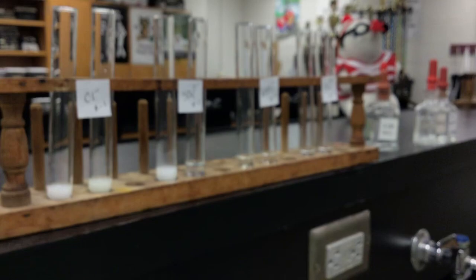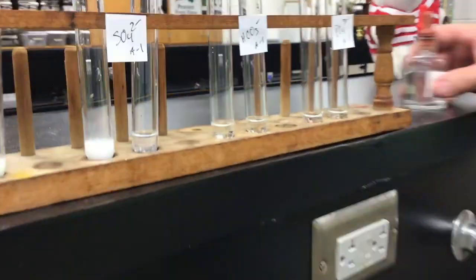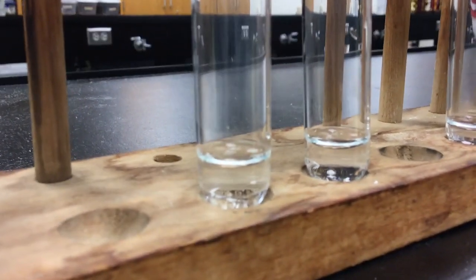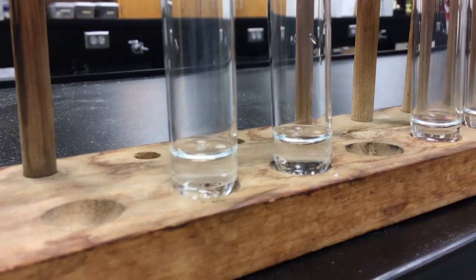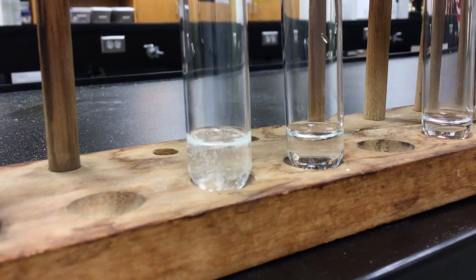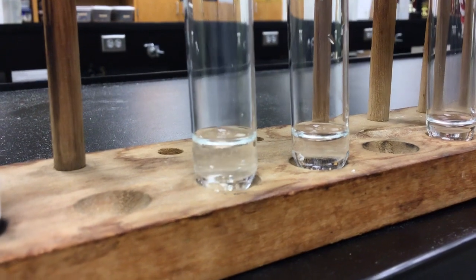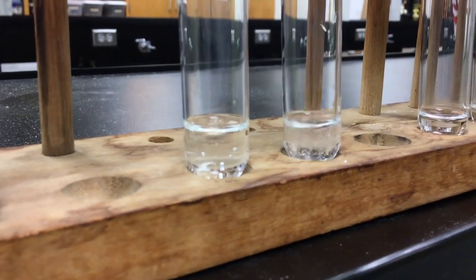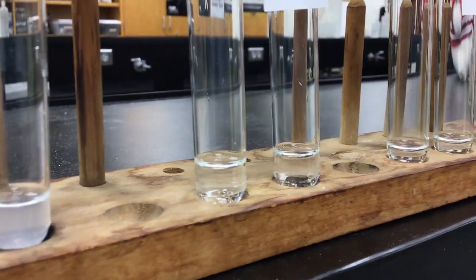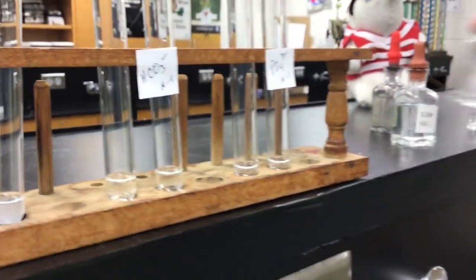And next we'll try the bicarbonate. For the presence of hydrogen carbonate, you're going to look for bubbles. You're going to look for some reaction taking place. So I think she's zooming in so that we can actually see if that occurs. And we'll look at the other one. Okay, write down what you see.